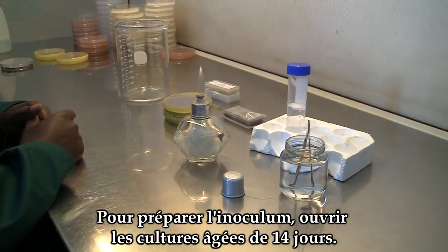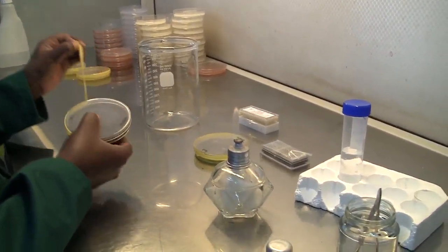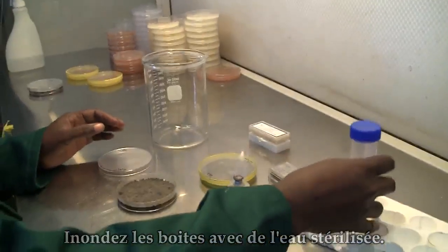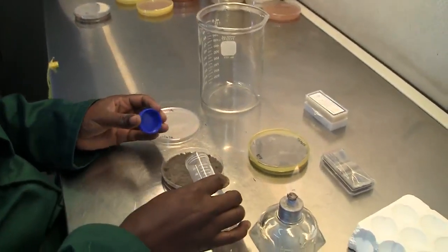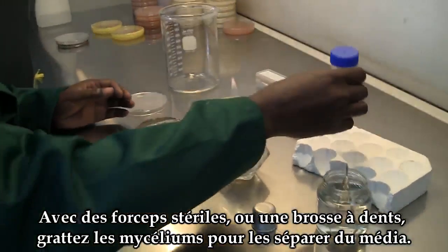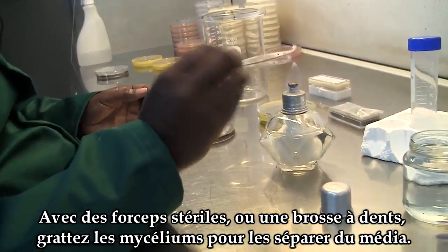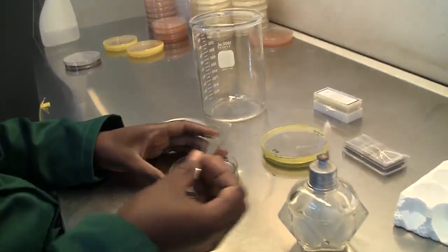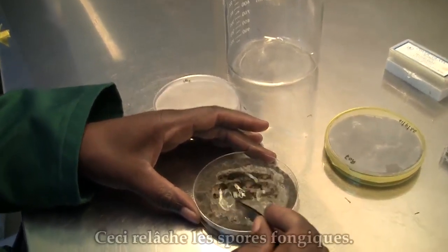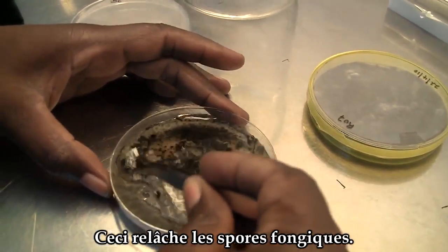To prepare the inoculum, open the 14-day-old cultures, flood them with sterile water, and using a sterile forceps or a toothbrush, scrape the mycelia off the media. This is to release the spores of the fungus.